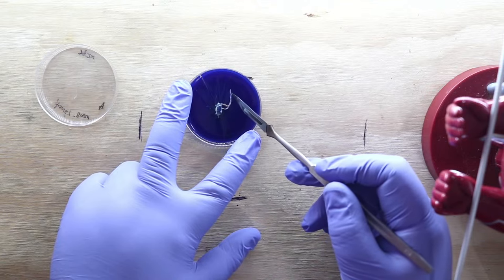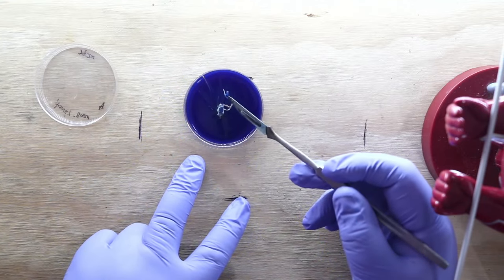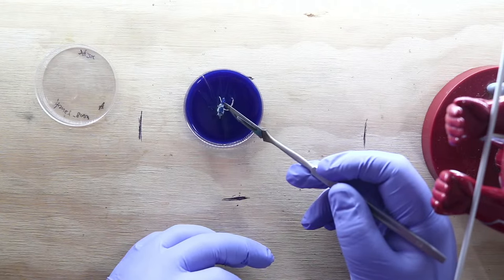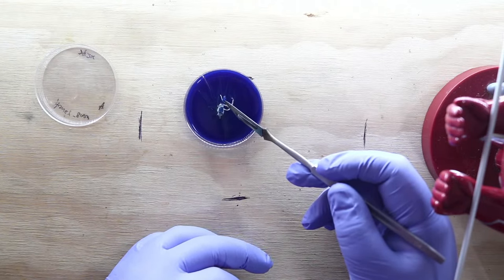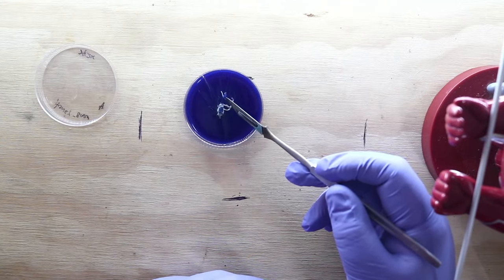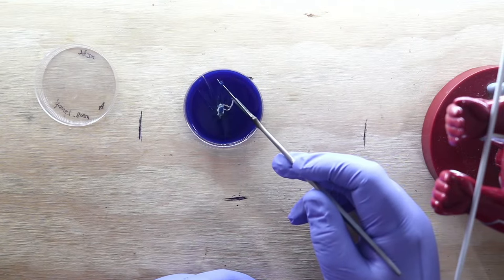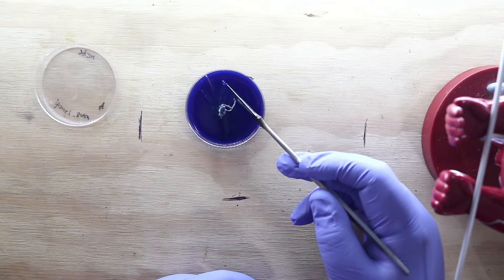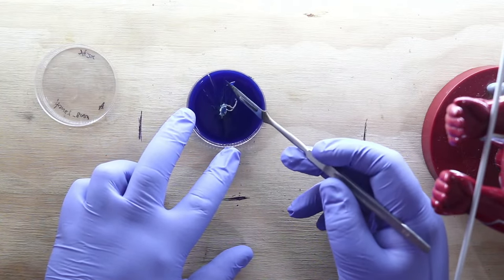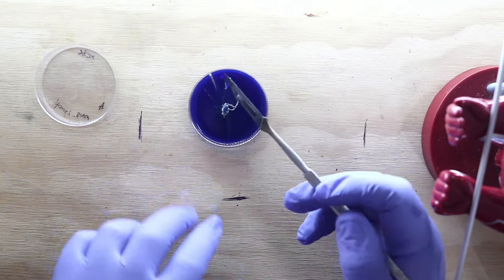And when they find these tree roots, they wrap around them and then constrict. They swell up with water really hard, and when they swell up with water, they end up constricting the root and basically choking it out. And once it's choked out, it's dead, and the honey mushroom can move in. So I'm just going to place that right there for the moment. There we go. They're very grabby.